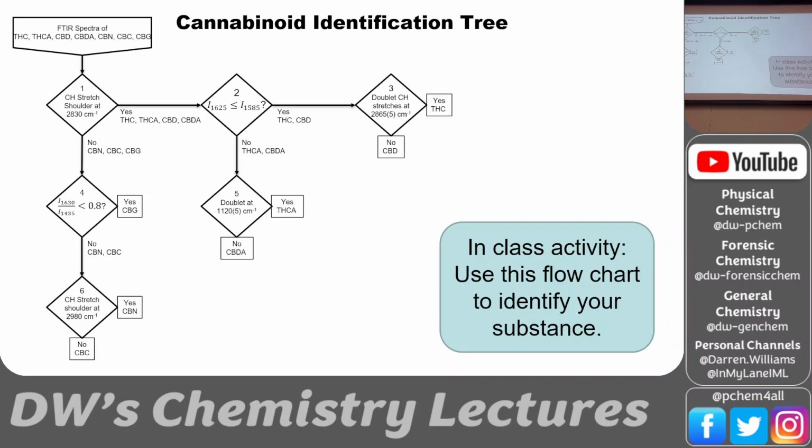So that's unique to see. We should look at the molecule and see what it is about CBDA that's being absorbed.